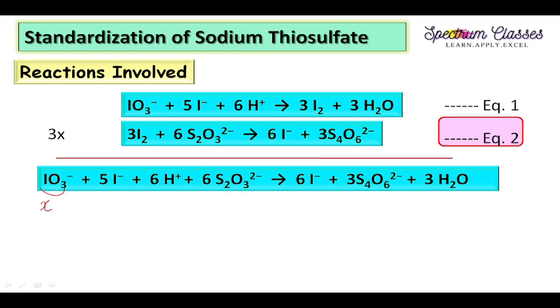Say I want to calculate for this iodine. So I plus 3 times minus 2, for one oxygen we have minus 2, and this will equal minus 1, the charge which remains on this ion, right? So this X you will get as plus 5 after solving.